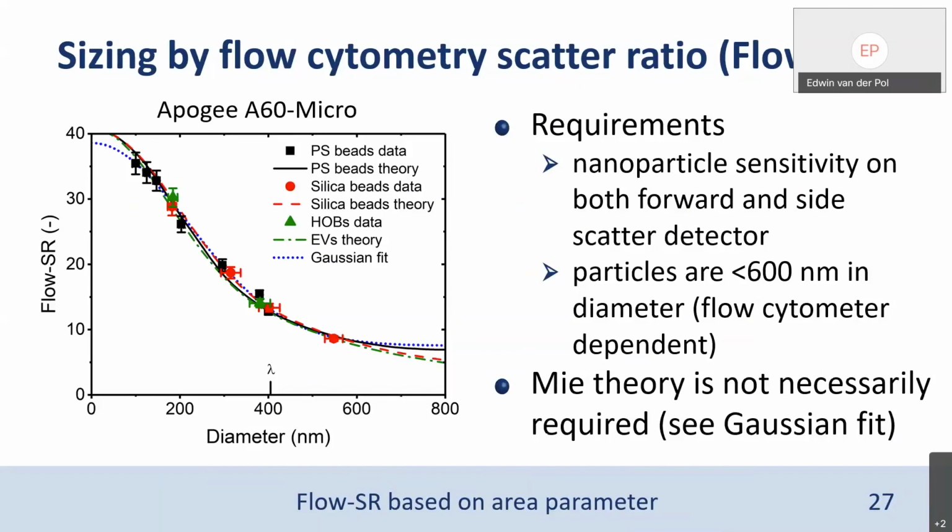We ate as much fatty food as we could in the morning. So we took a milkshake, a really British breakfast with some bacon, and we found a 50-fold difference in the lipoprotein concentration. Then some of the particles larger than 1.42. Minor concentration difference in labeled EVs.